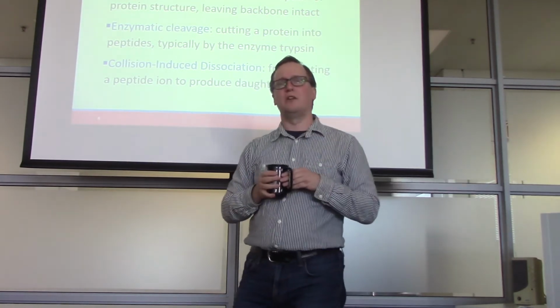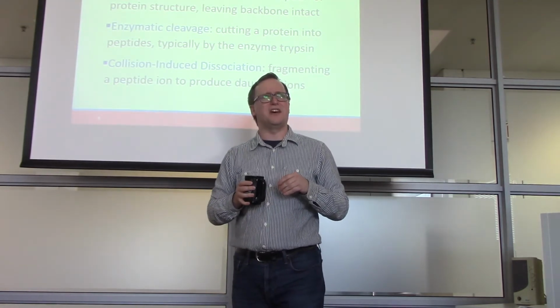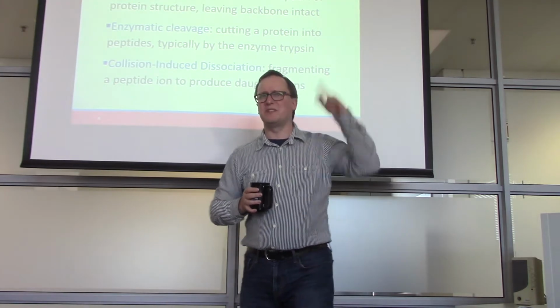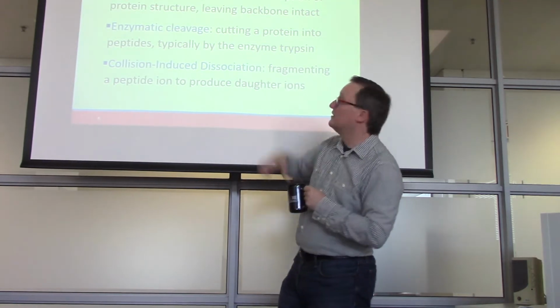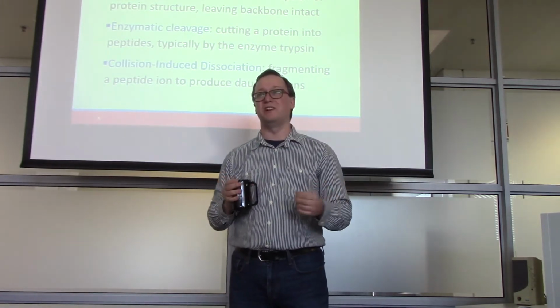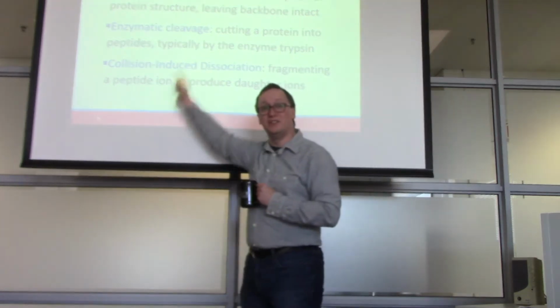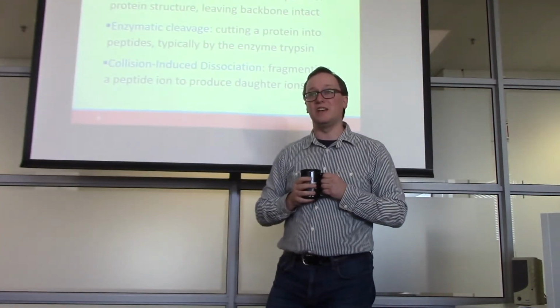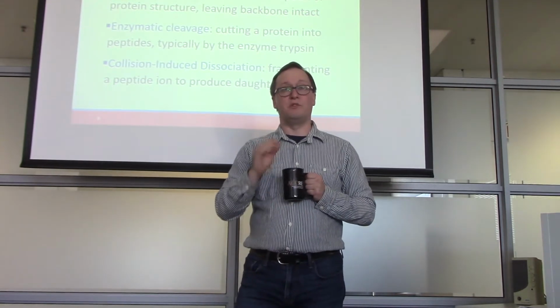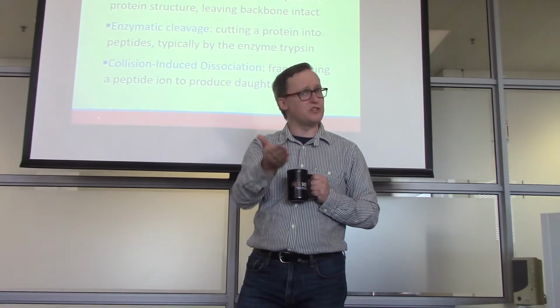One of the compounds you hear about frequently in proteomics is called DTT, the dithiothreitol. Anyone ever work with DTT? Well, maybe someone has, I don't know. But in any case, denaturation and reduction are going to help us eliminate the 3D structure of the protein and get it to stretch out. Once it is stretched out, we can use an enzyme on it. And that enzyme is going to digest particular peptide bonds. The enzyme that we use more than any other is trypsin. Where does trypsin cut?